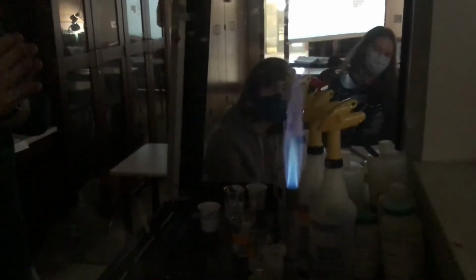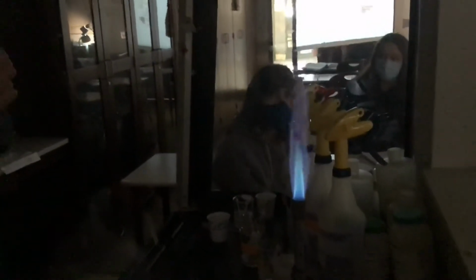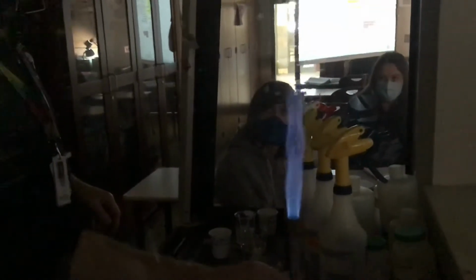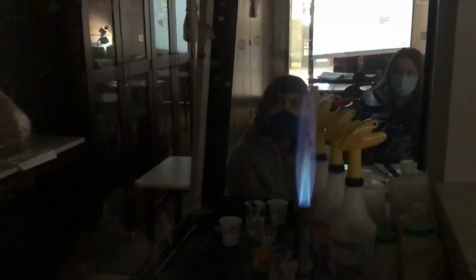All right, so here we go with the flame test lab. In this lab, I have a Bunsen burner that's burning a blue flame. It uses methane gas, and that's the color that it traditionally makes. So don't mess that up with the colors of the metals that we're gonna burn.